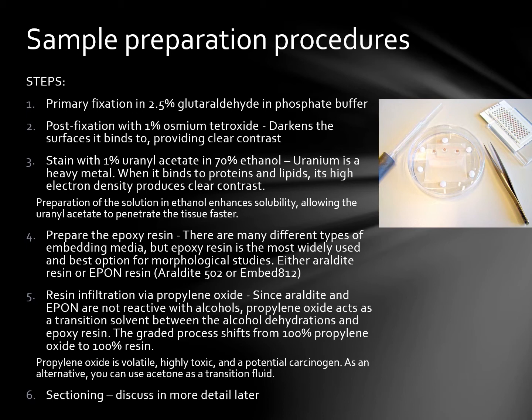So step 4 is to prepare the epoxy resin, if you require it. There are many different types of embedding media, but epoxy resin is the most widely used and best option for morphological studies. Araldite and EPON resin are the most popular.